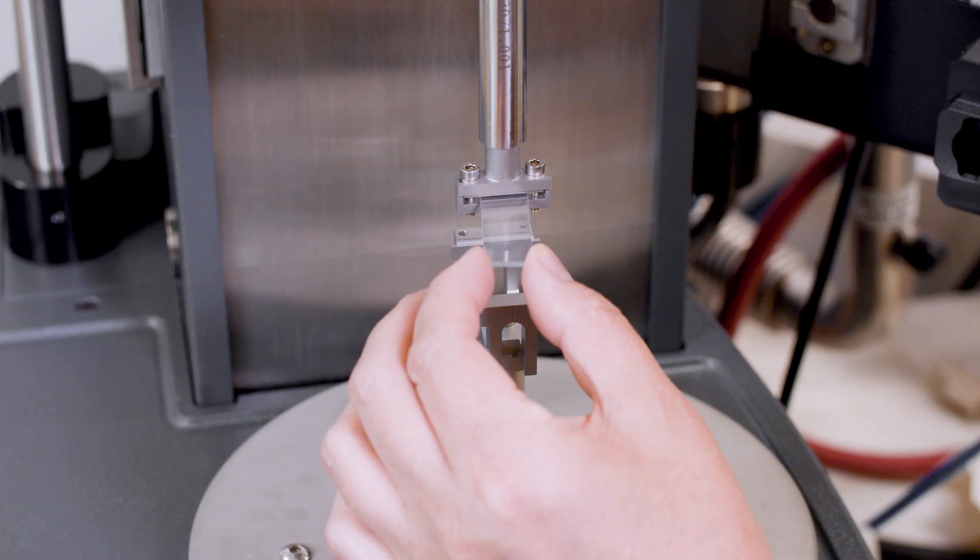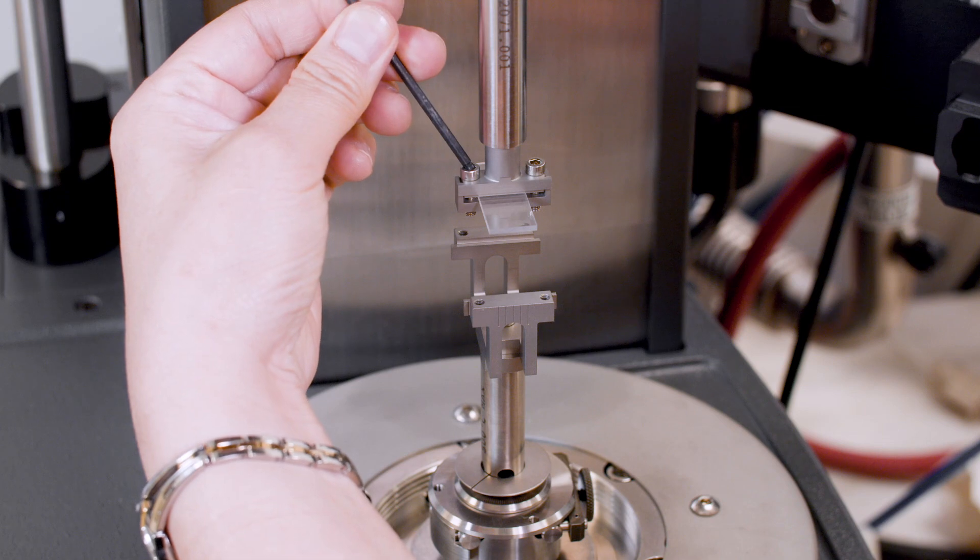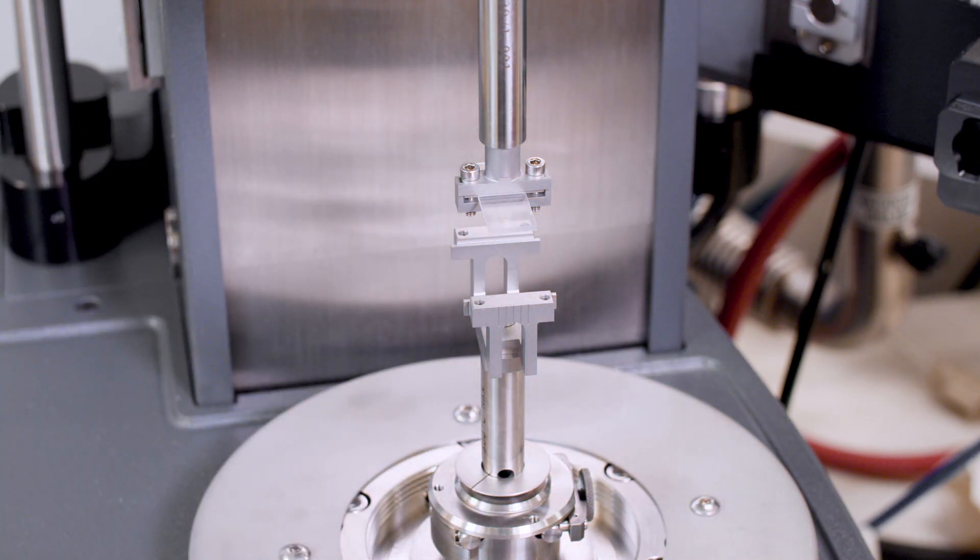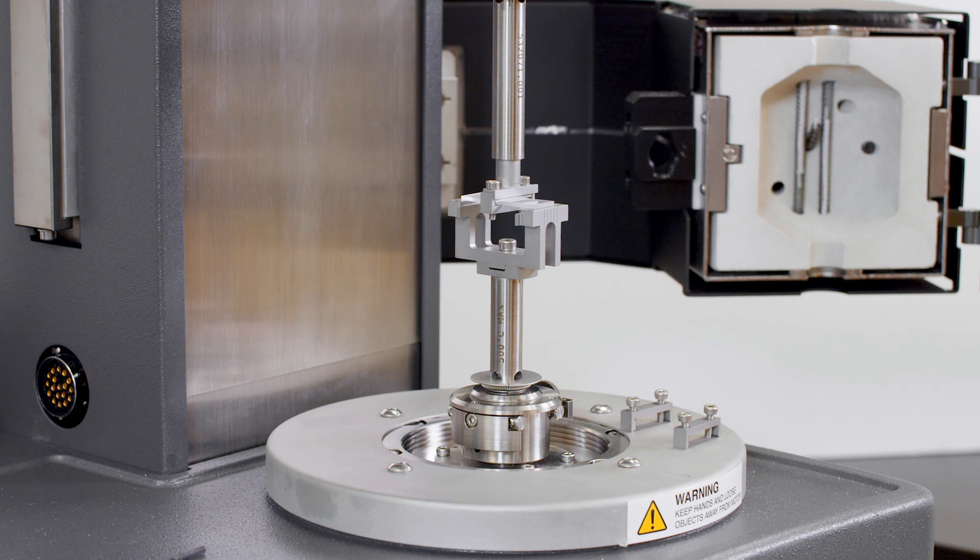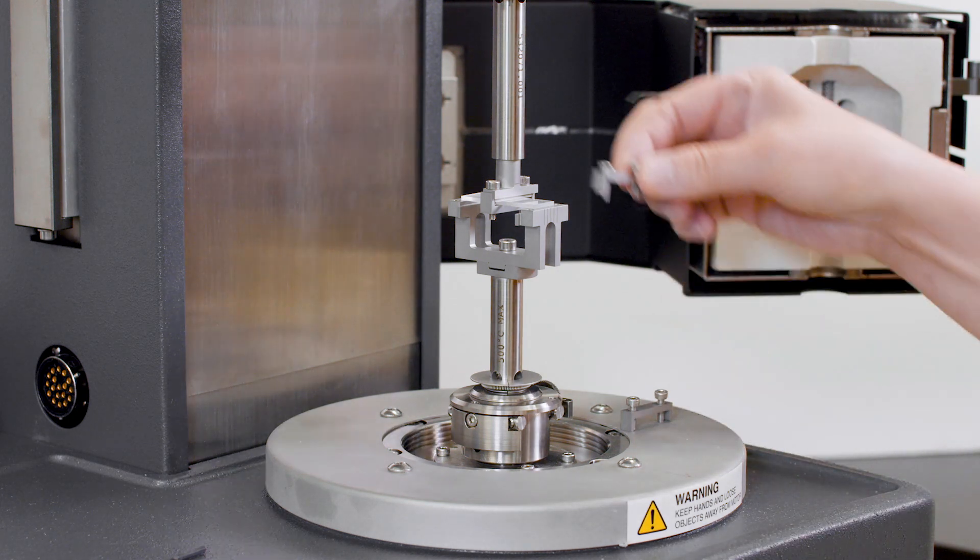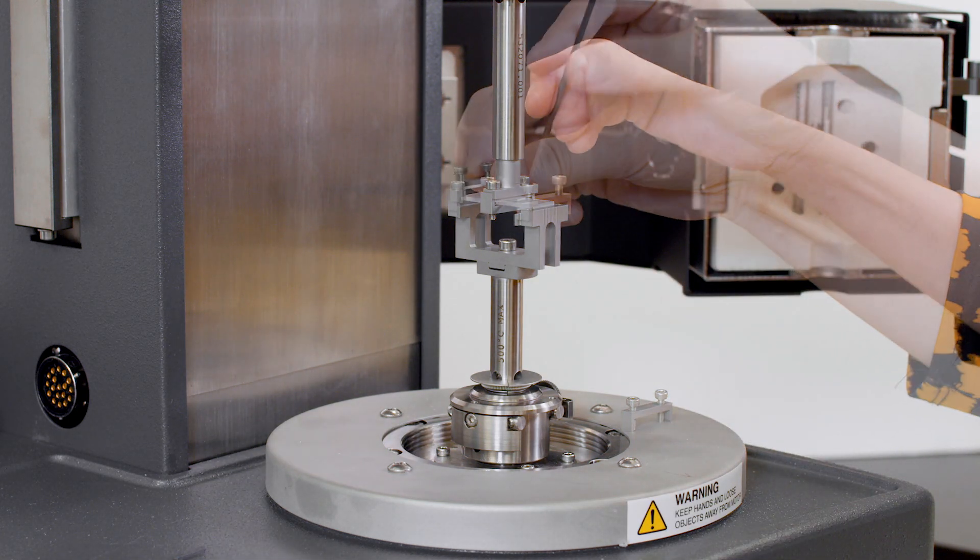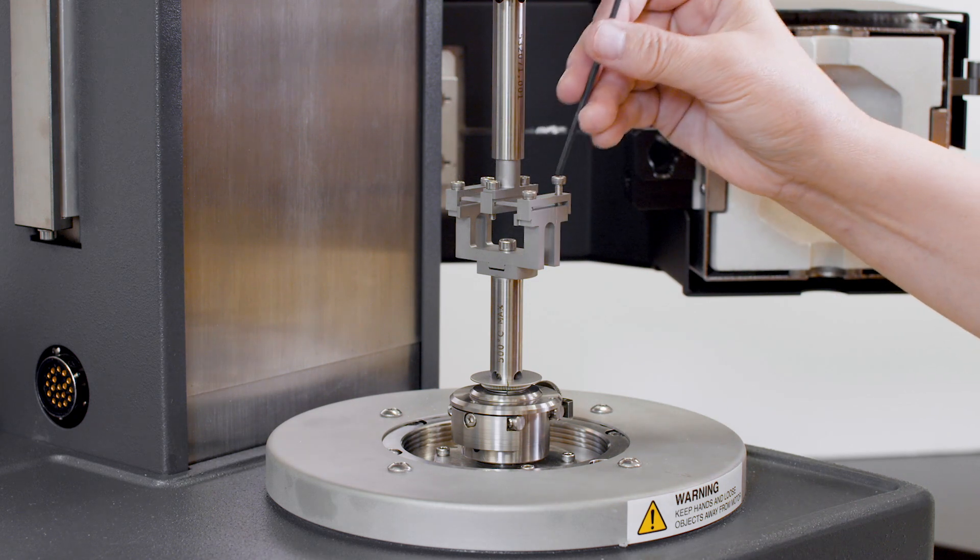Insert the sample to the upper clamp and tighten the screws. Slowly lower the upper clamp until the sample is in full contact with the bottom clamp frame. Then, put the clamp face on and tighten the screws.